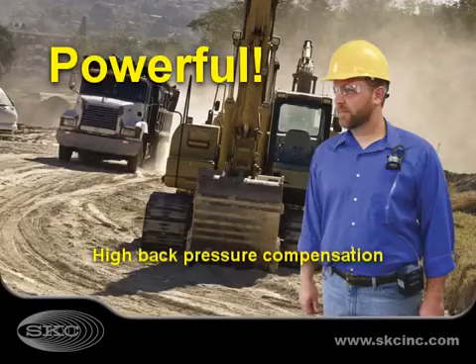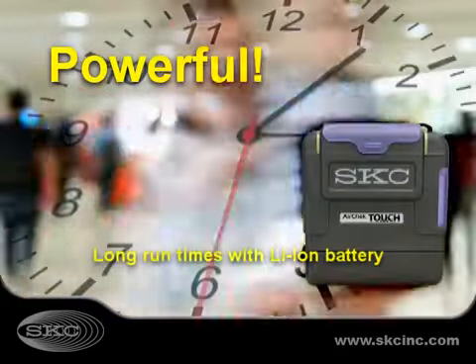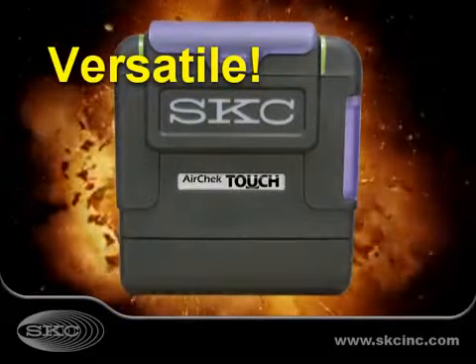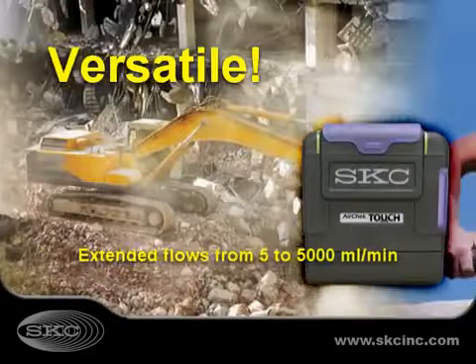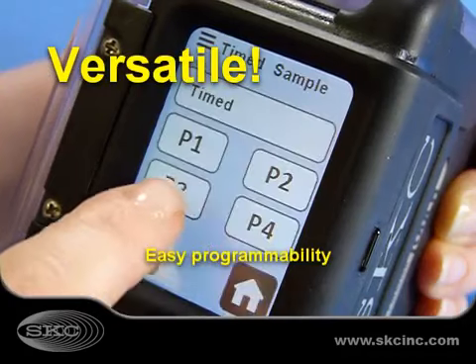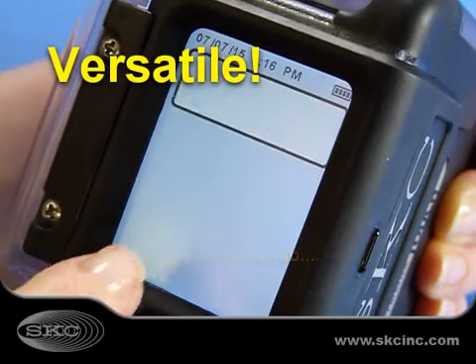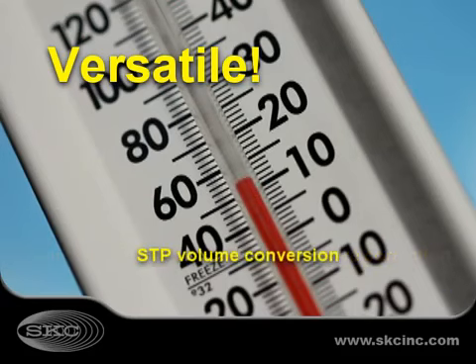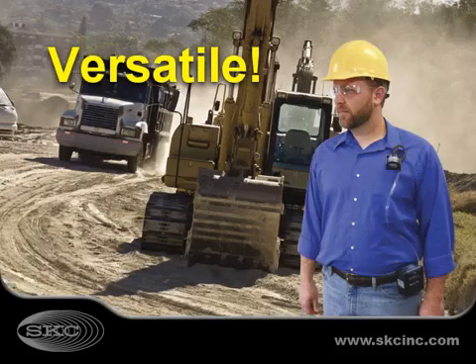Powerful AirCheck Touch provides high back pressure compensation and run times in excess of 12 hours. With its wide 5 to 5,000 milliliter a minute flow range, touch screen or PC programmability, real-time flow display, and automatic flow correction, AirCheck Touch is the best choice for today's sampling applications.